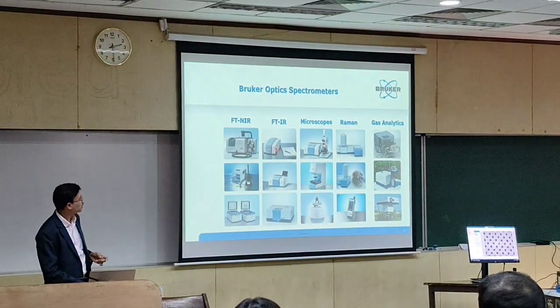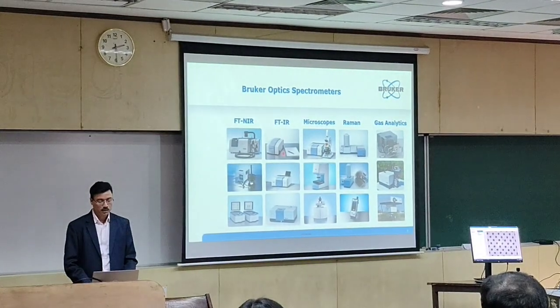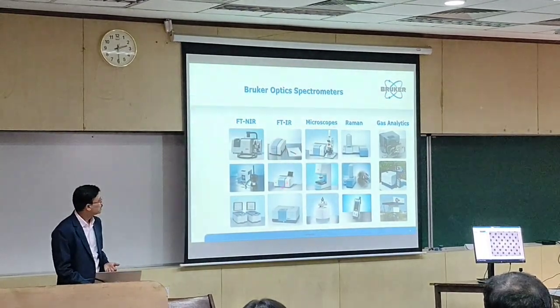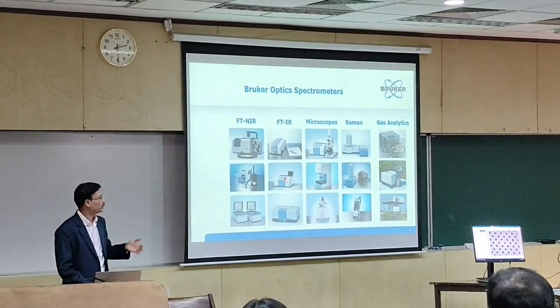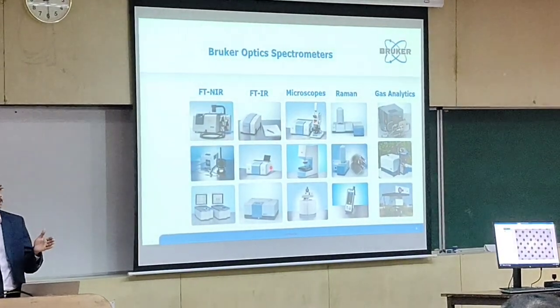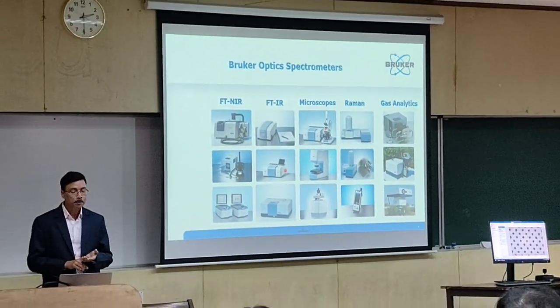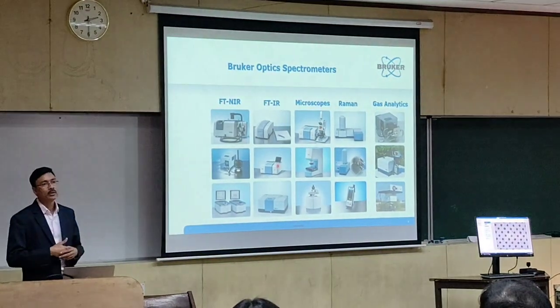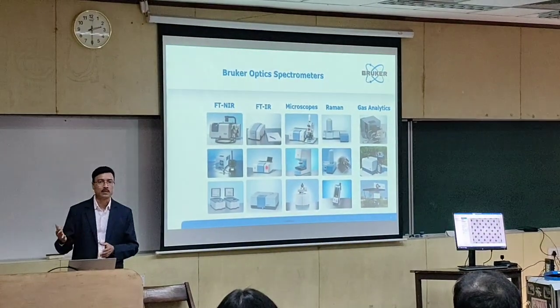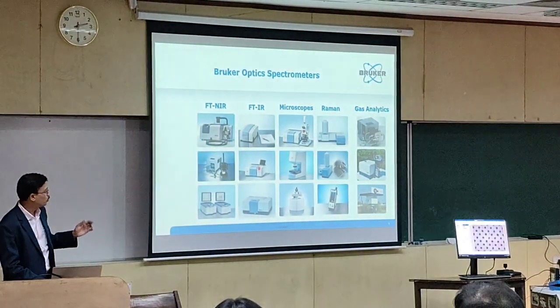We can attach these accessories and do measurements like transmission, ATR, reflection, or maybe front reflection accessories. Many accessories are available with this spectrometer. And then this is another FTIR spectrometer, which is a high-end FTIR system. In this, there are different features available, like you can cover different spectral ranges like mid-IR, far-IR, near-IR, visible, etc. Also, hyphenation of different techniques is possible with this. We can connect techniques like microscopy, a Raman module, or an external sample compartment. So here the scope of this instrument is bigger.